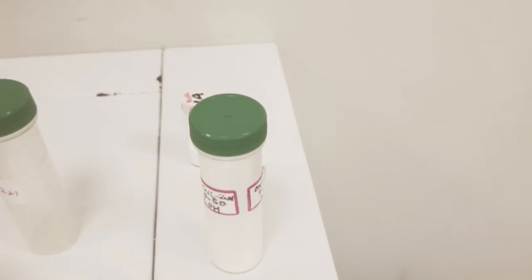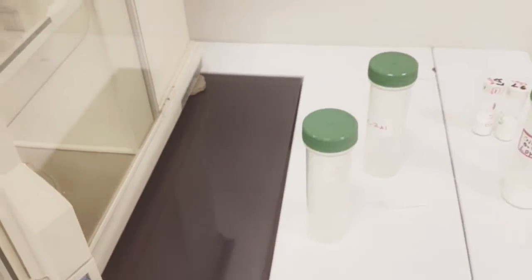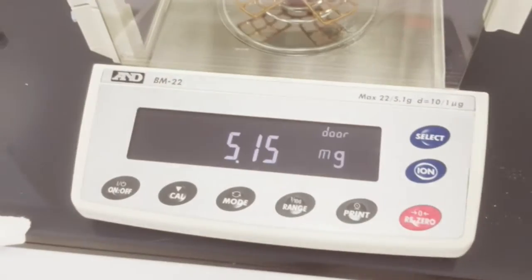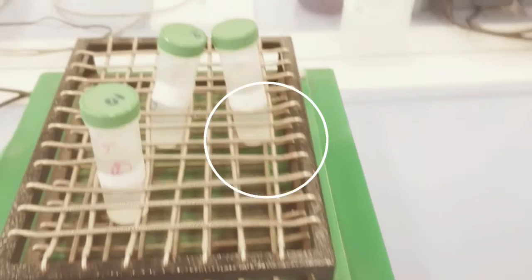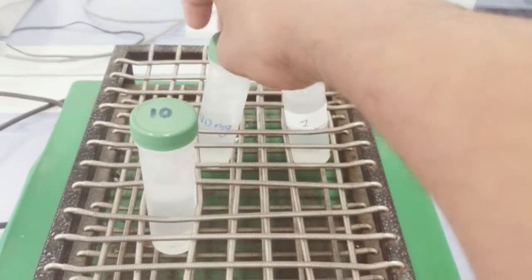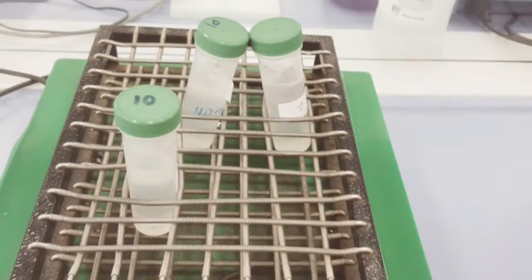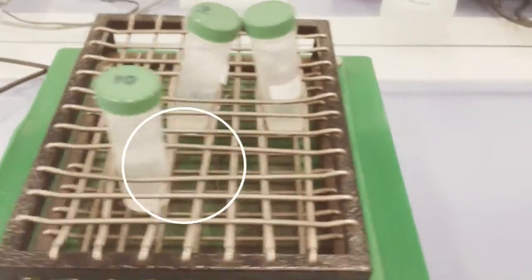We are testing 3 adsorbents here. You can see this is the first one, second, third one, and we will weigh around 5 milligram of each and transfer into these vials. Then we will transfer the prepared emulsion. Already the adsorbent is transferred to these vials. Now we will shake it for 3 hours and then check the removal. So the vial has begun to shake.